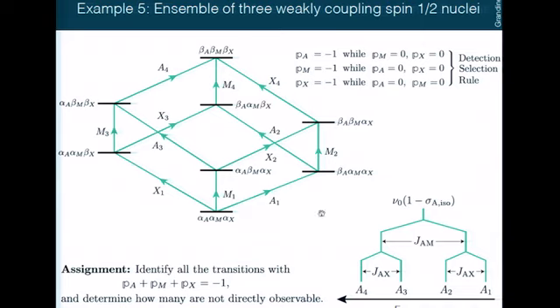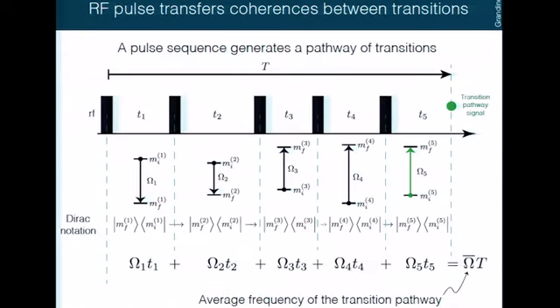For these observable ones, we're going to get a multiplet for the A's, a multiplet for the M's, and a multiplet for the X. Those are the transitions you'll observe in the spectrum.